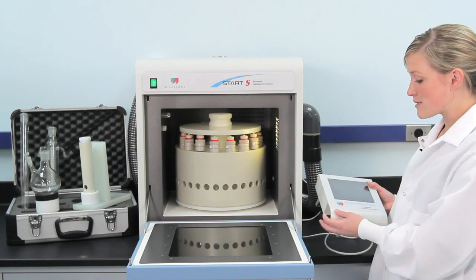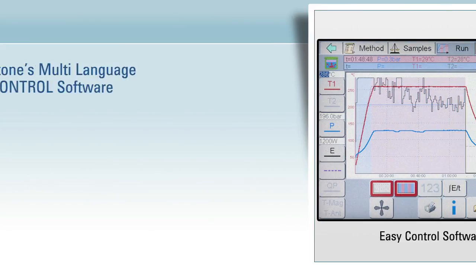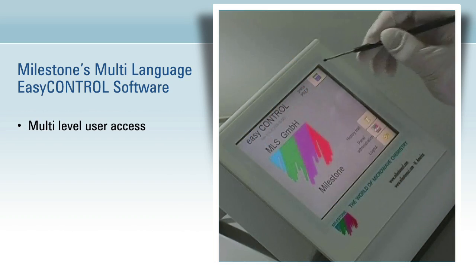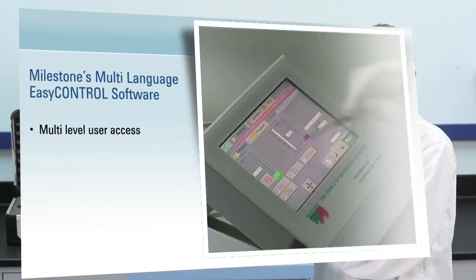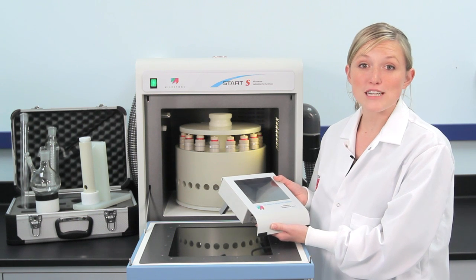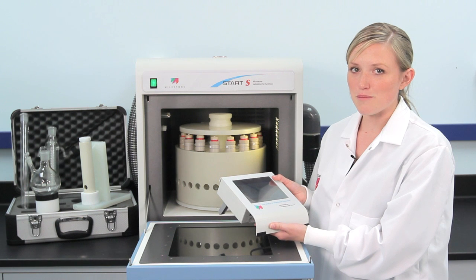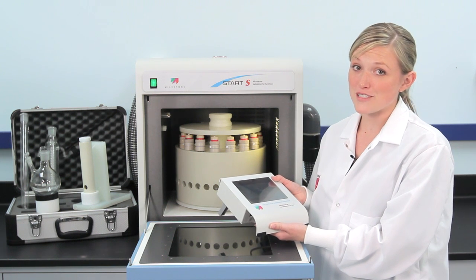The Start is controlled by this color touchscreen terminal graphical display, which runs Milestone's Easy Control software. This software features multi-level user access. It can be set up so that a student is able to start a run but cannot modify instrument parameters — great for teaching labs.